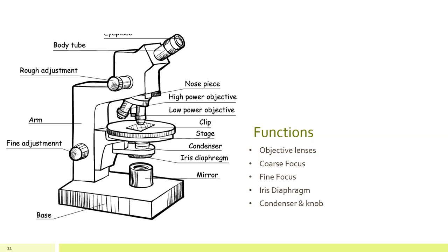And so part of doing this work, in order for you to actually get a nice crisp image, there's a few things that are important. But let's start with the objective lens here. The objective lens, typically we actually have a magnification at the objective lens right here. We usually work at 4x, 10x, and 40x. 40x is where we do most of our work. And then the eyepiece actually adds another magnification there too, typically 10x.